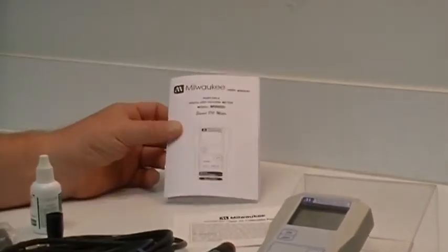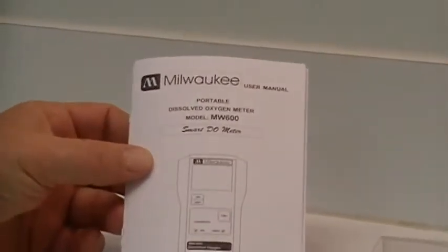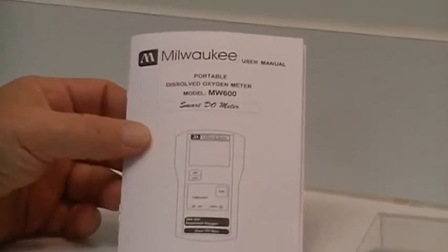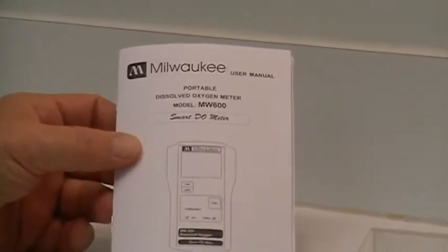Today we're going to do a calibration procedure for the dissolved oxygen meter model number MW600. When you first open up your unit, you're going to find an operator's manual.